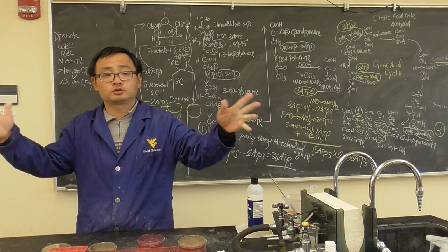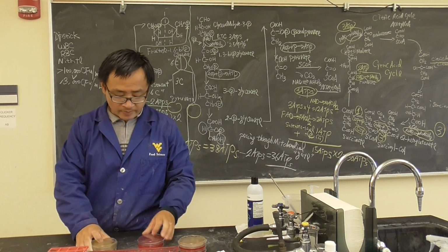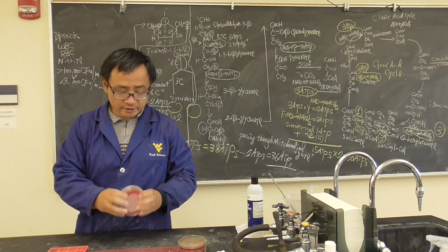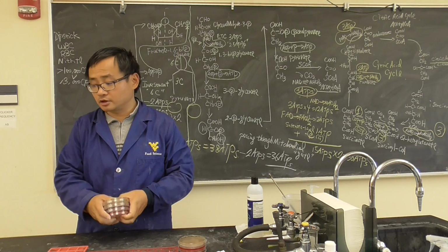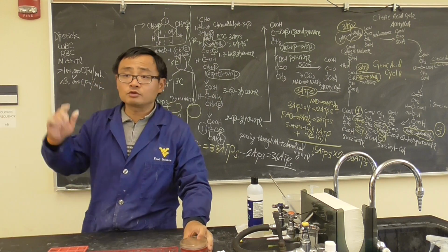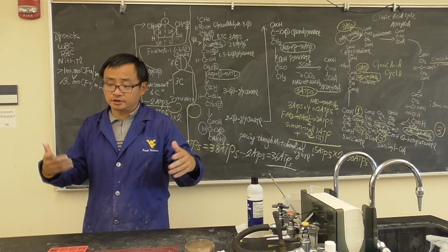That's something, just a case, okay? Not saying you or he, just a case analysis, okay? So that looks good. The lab work did really good. We didn't have a horrible colony growth there. So that's the work we did last time. That's very interesting to have your clinical trial.